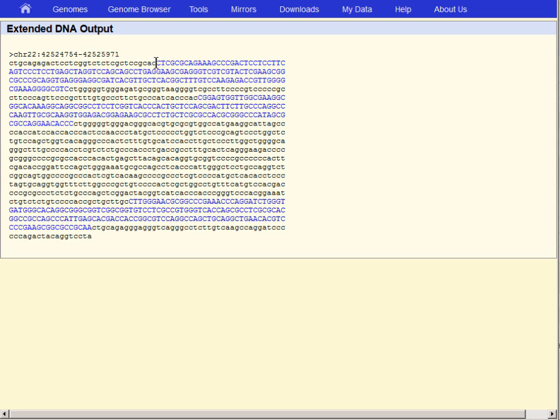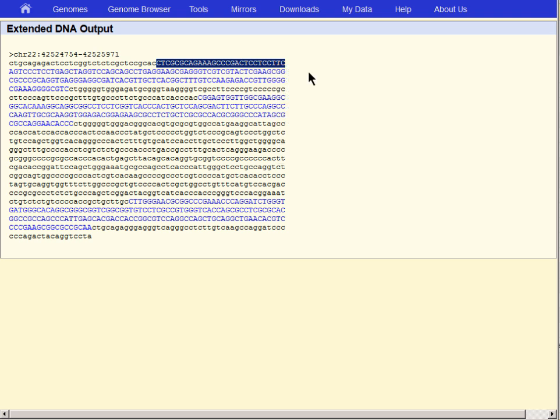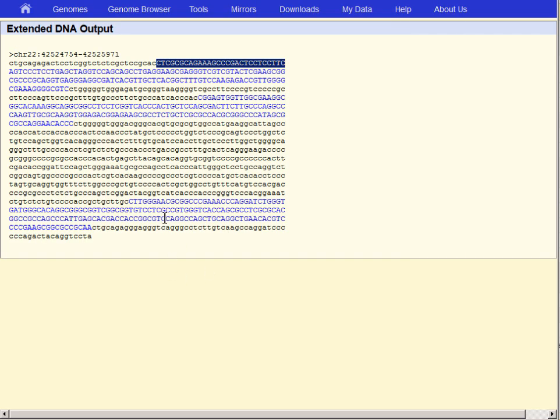You can see here that we have three blue exons in capital letters. We obtain our first primer by copying from the top, the 5' end of the sequence of the upper strand of this exon. We will get a chunk of DNA large enough to serve as a primer, and paste it into a text file so that we can use it twice in our demonstration. Now we'll grab a chunk of DNA from the other end of this region, from the third exon, and save it also to a text file.